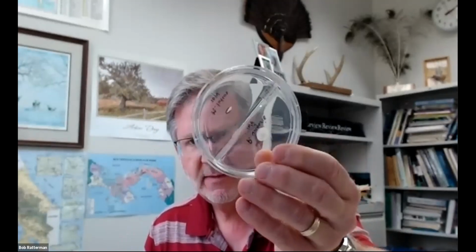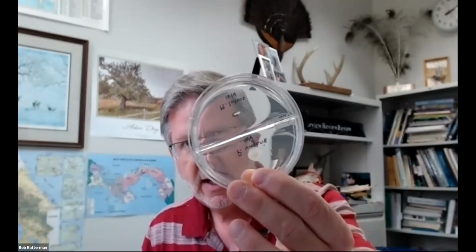This is basically a Petri plate that is divided into halves by a little partition, and Deb made up some motility media that the students inoculated two different bacteria into, and these are the two listed in the lab book. Proteus vulgaris is one, and Micrococcus luteus is the other.